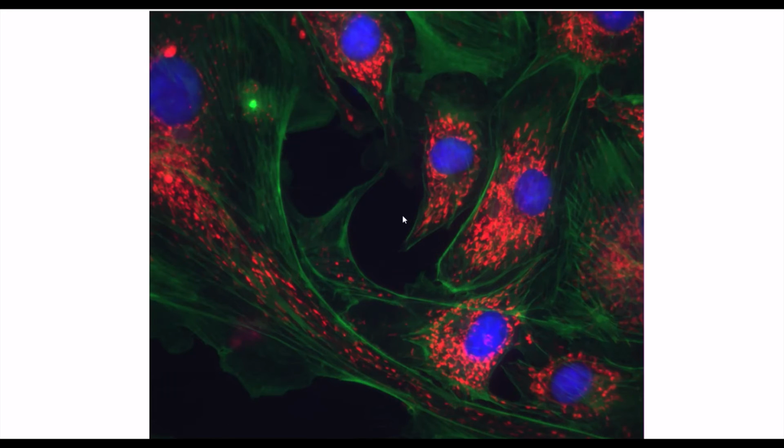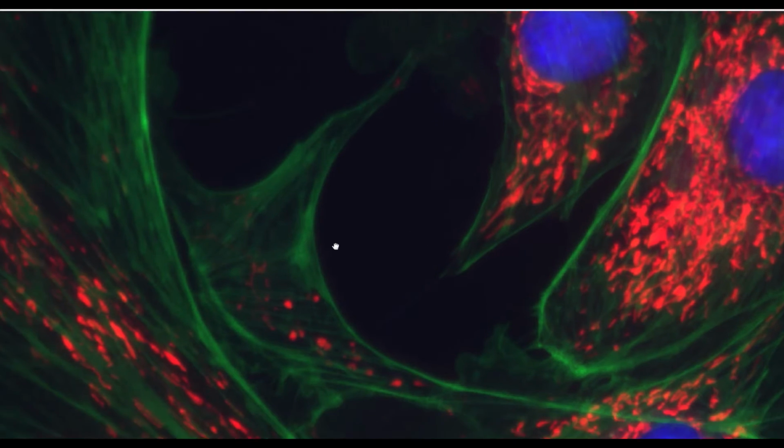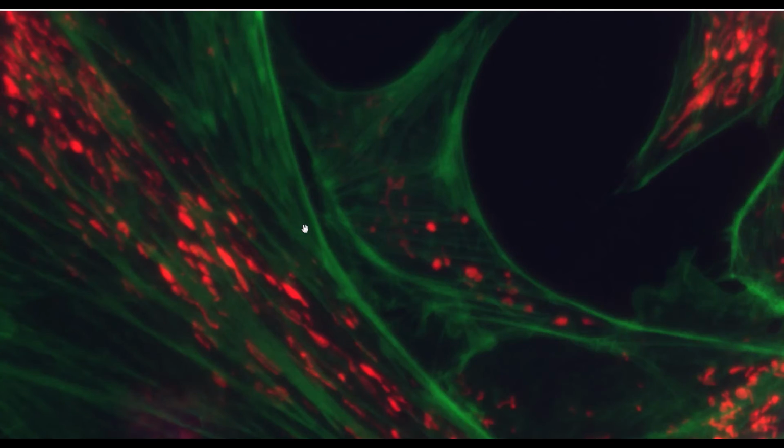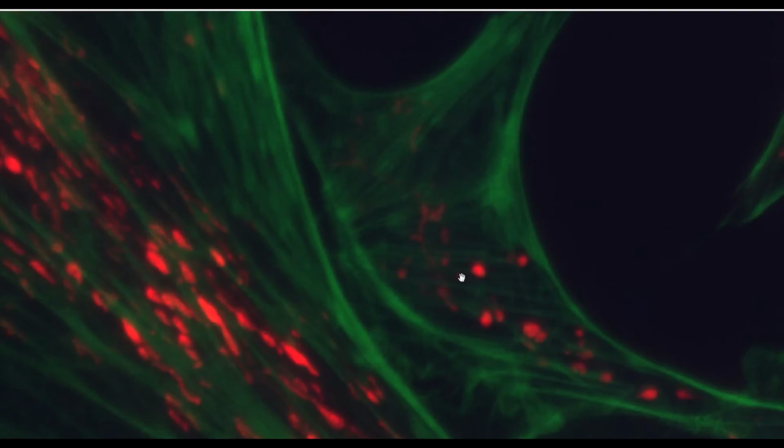In this image, taken at 60x, we can see that each pixel samples around 150 nanometers, as shown in the table. It's important to recognize that any object smaller than the diffraction limit will appear as large as the diffraction limit in an image.